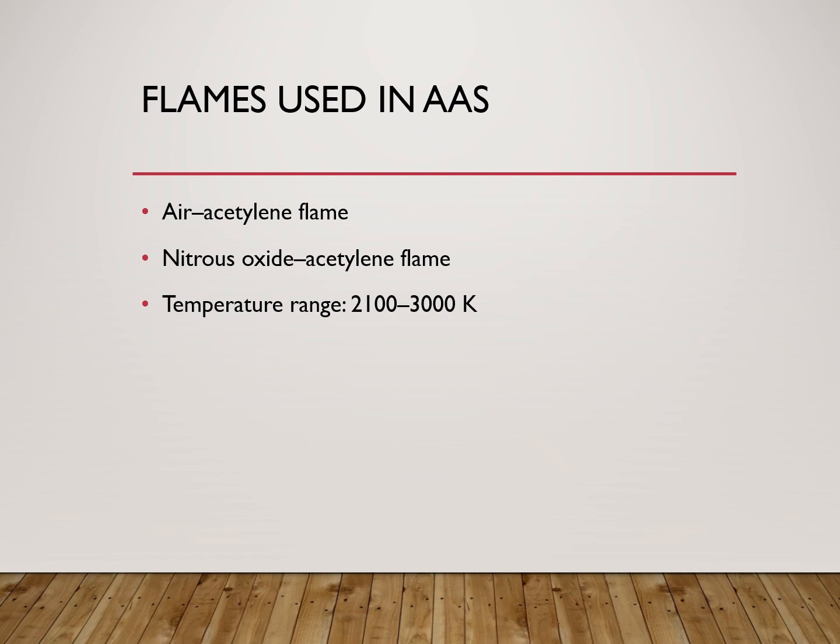The commonly used flames include air-acetylene flame and nitrous oxide-acetylene flame, and the choice of flame depends on the element being analyzed and its excitation temperature.